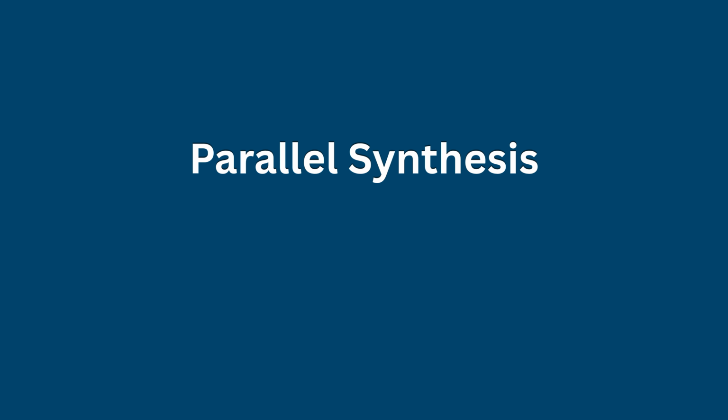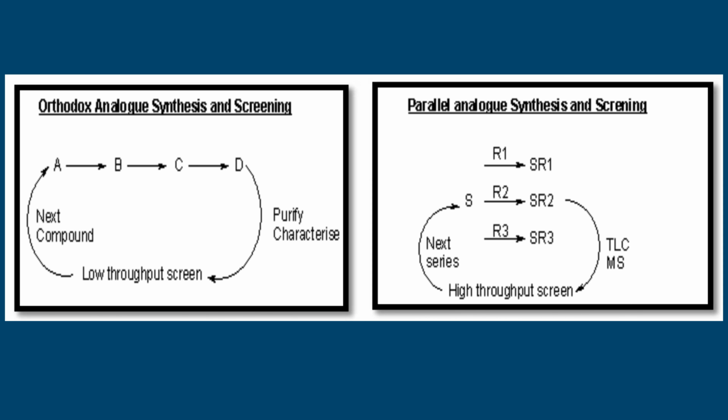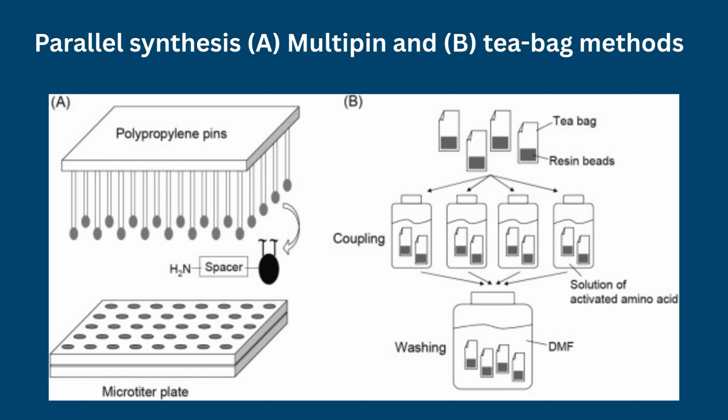Parallel synthesis represents another key methodology in which multiple reactions are conducted independently but simultaneously, typically in multi-well plates using automated or semi-automated systems. Each reaction vessel yields a distinct and structurally defined compound, making this approach particularly valuable for structure-activity relationship studies and lead optimization in drug discovery.